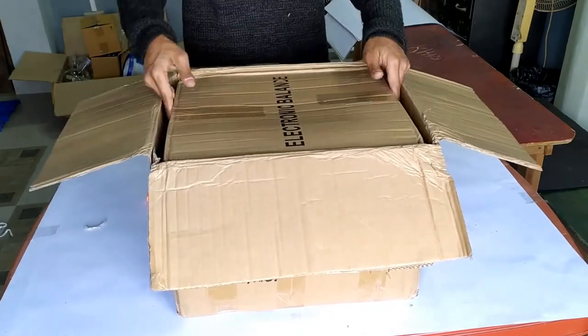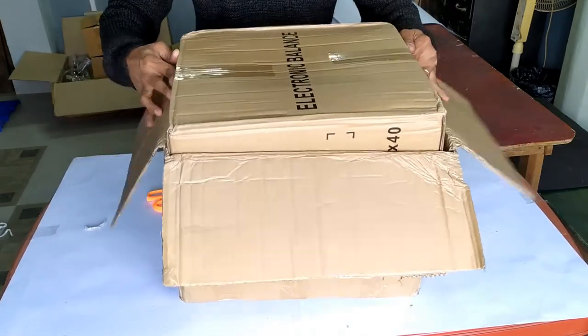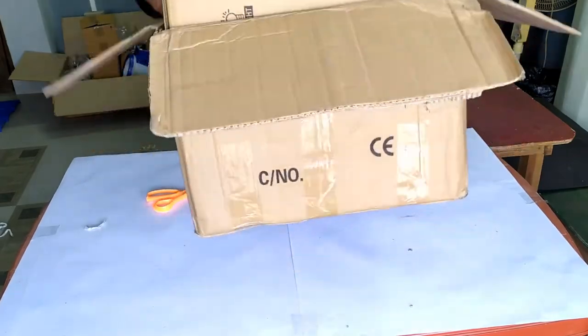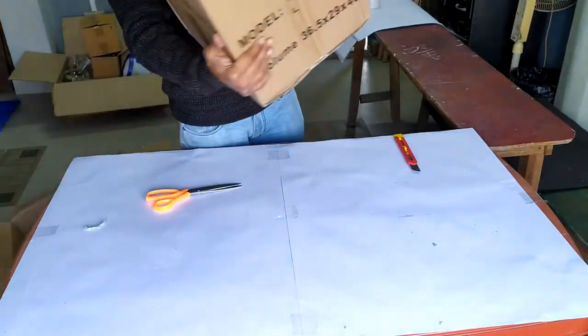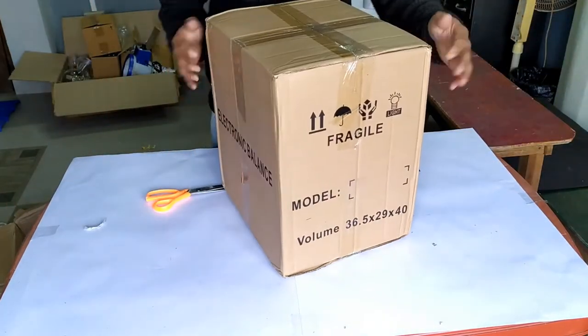A box within a box. This one has electronic balance printed on it. So far no mention of the model name A107 anywhere in these boxes which is kind of weird.